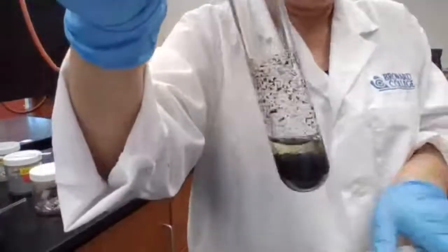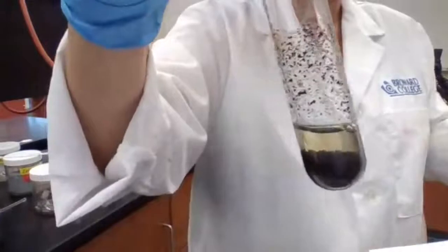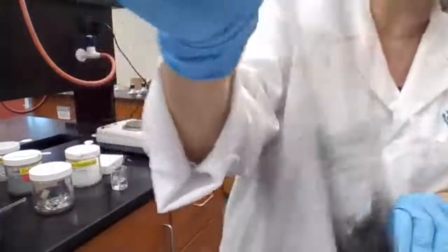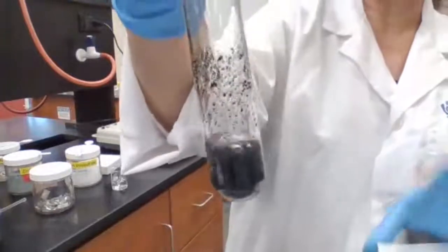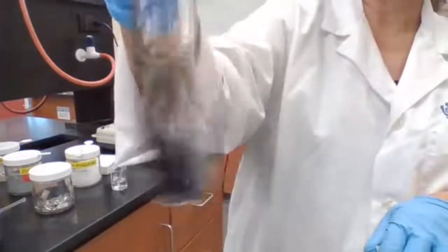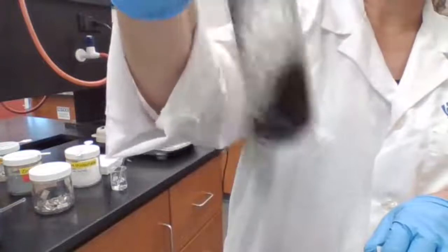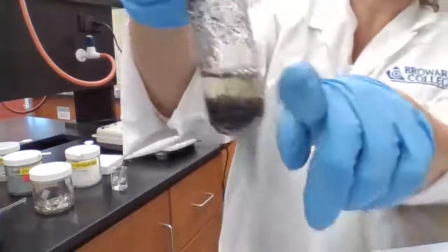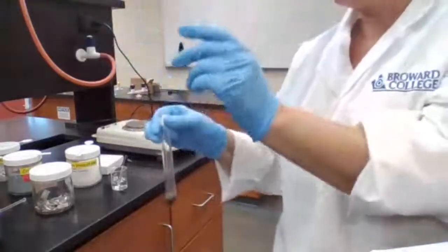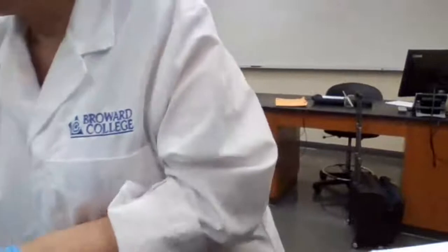Then now we have to record the temperature, the exact time. No, we don't have to record the exact time. Now we have the black color. So it took a while, you can replay and see how long it took, because it's just live action. You can see how long it took to get to this color. Now, we are going to test the same experiment.